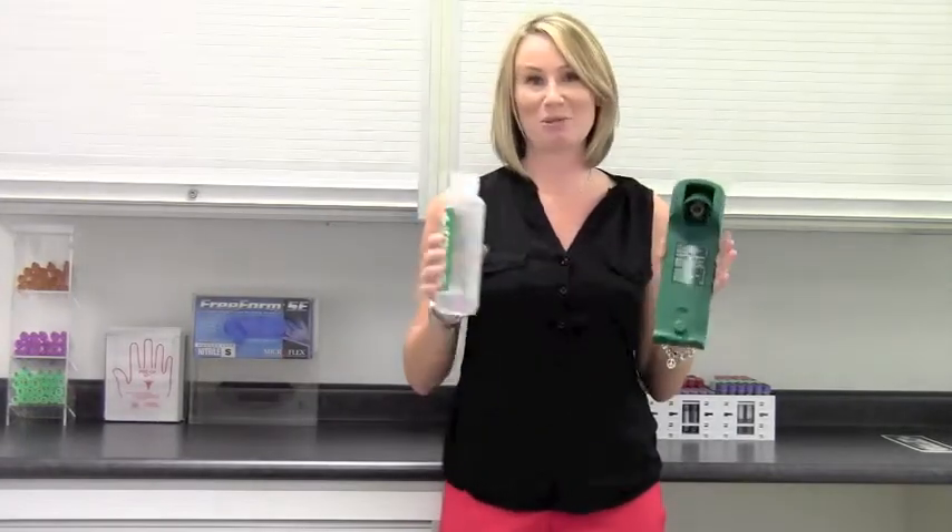The wall mount kit that's included has an integrated dust cover that also acts as an opening device. Simply twist the bottle to remove it and it's ready for use.